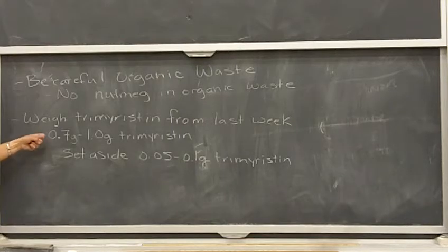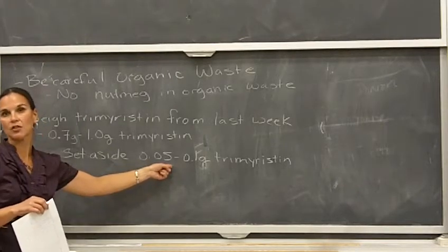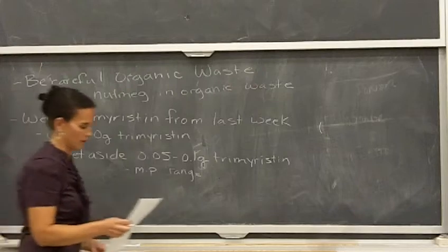If you don't have enough for the saponification reaction, so you don't have the 0.7 to 1 gram, a lot of times in lab we end up with people that have extra, and so we'll figure out in lab who has more trimeristin that you potentially could borrow from and who has less and needs that. Usually it balances out, that some extracted more and can donate some, and some that didn't get as much can take the donations. If you end up using or donating any trimeristin, make sure you note all that in your notebook really clearly, where things went or where things came from. But regardless, make sure that the trimeristin you set aside is your own. And if you need a little extra for the reaction, that's fine. Like I said, we're going to talk about how we use this for melting point determination for trimeristin.